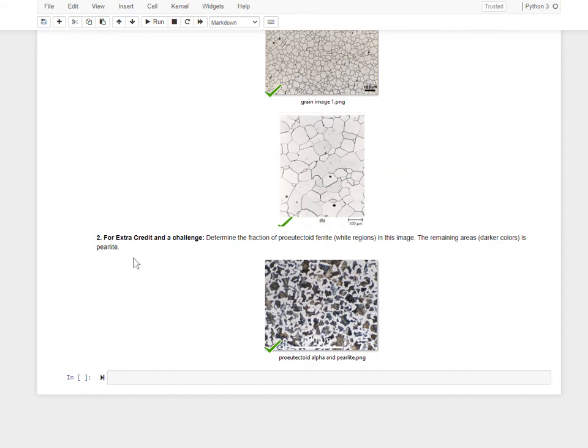For part 2, for extra credit, or if you want a challenge, I haven't actually done this one yet, but I think this would actually make kind of a neat problem, is to see if you can use this technique now, but just grab the white regions from this picture. Okay? And so these darker regions now would all be considered background. So this is where you're going to want the true background that we did in lesson 1, part 1. You're going to actually want there to be a background, and that's, again, these dark regions. And you really only want to analyze the white regions.